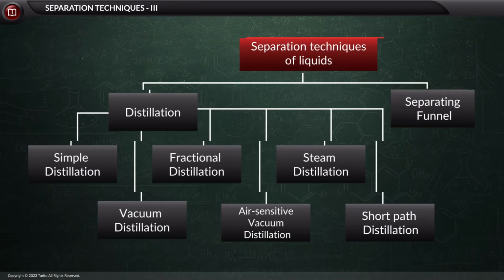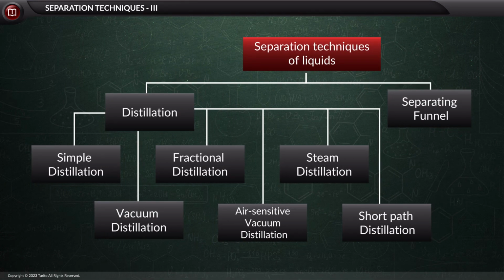So, in this video, we learned about different distillation techniques and the separating funnel.